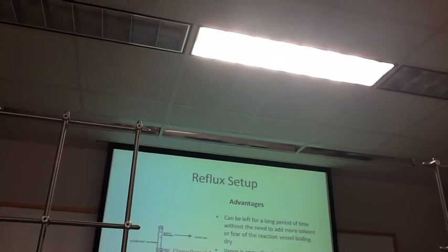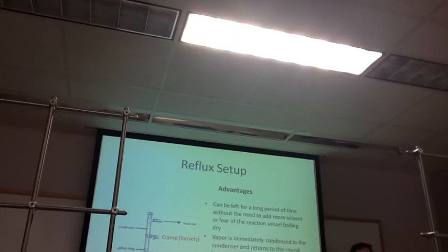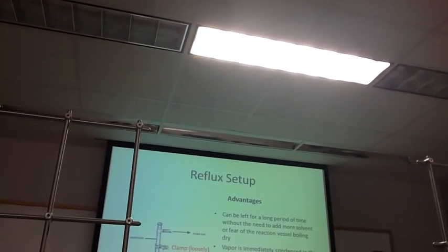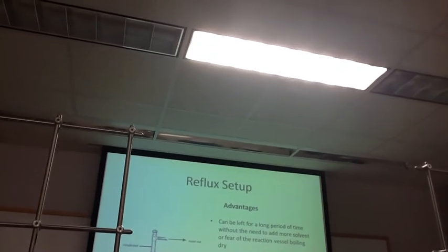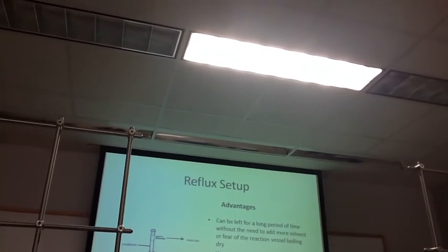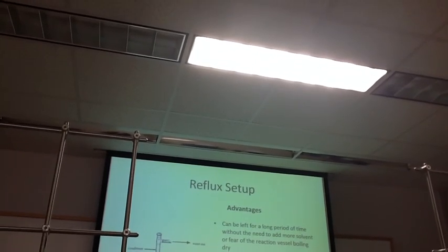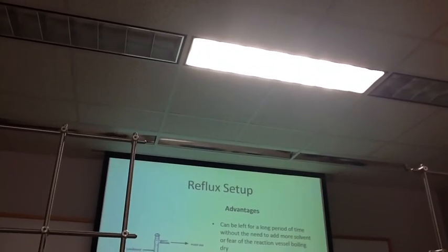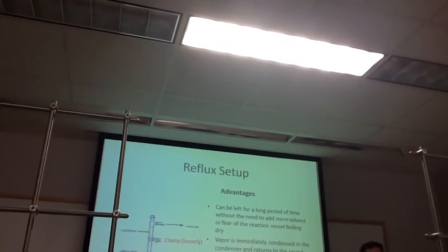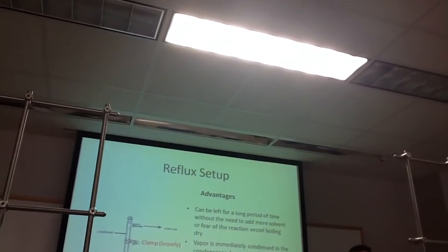Okay, that's fine. All right, and then also you notice these two little things sticking out of the side. This is where you're going to put water into the condenser. Now this is also where I talk about magic chemistry. I know this may not make sense, looks like it doesn't make sense, but trust me, it's going to work. We're going to put water in here. You're going to have this hooked directly into the water line in the fume hood. Turn your water on, it's going to fill up to here. Have another tube coming out of this part and out the top, draining into the sink. So you're going to put water in at the bottom, and it's going to come out at the top. So whenever you're doing this experiment, remember, water goes in at the bottom, comes out at the top. Whichever point is lower is where the water goes in, water comes out at the top then.